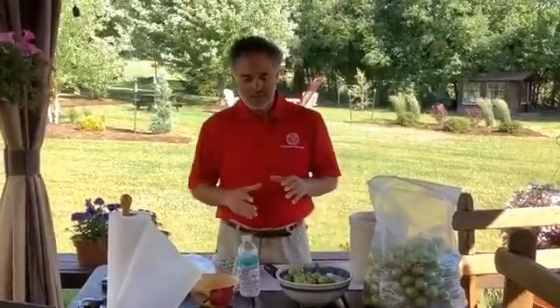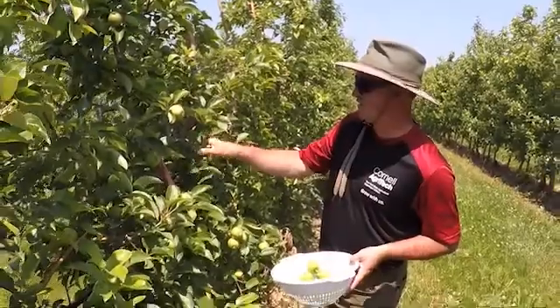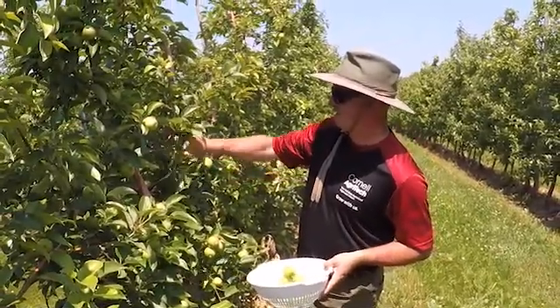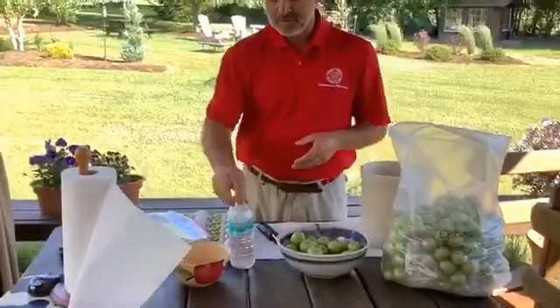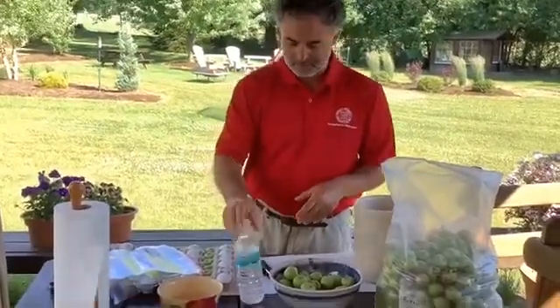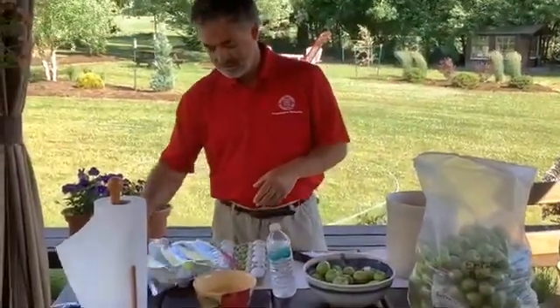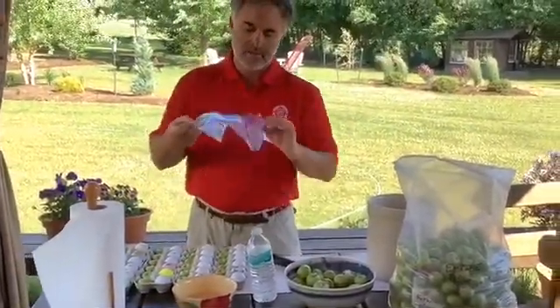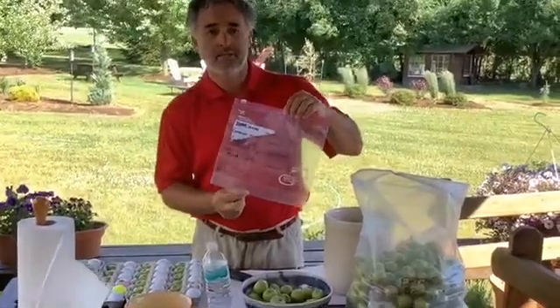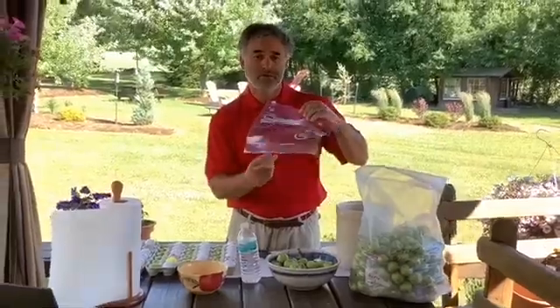So what you need for this is basically 30 fruitlets that you're going to collect from a mature orchard. You need purified water for the cleaning of the peel. You need a peel knife, and you're gonna need a storage bag that you're gonna put in your freezer with the contact information of your farm.